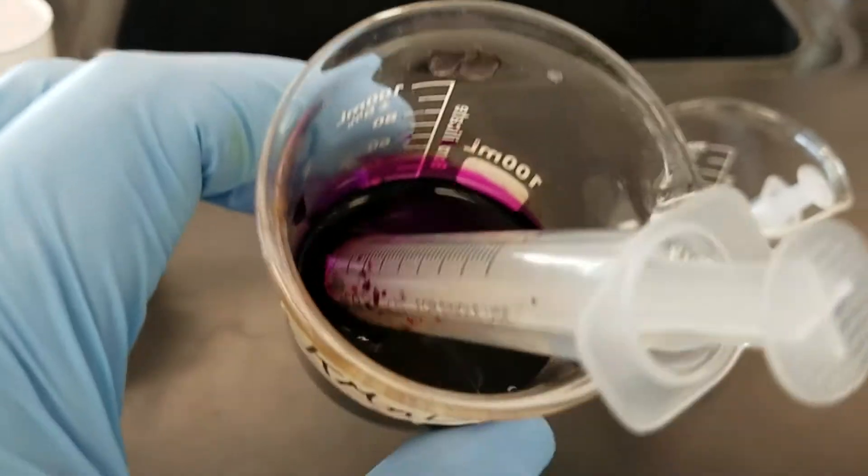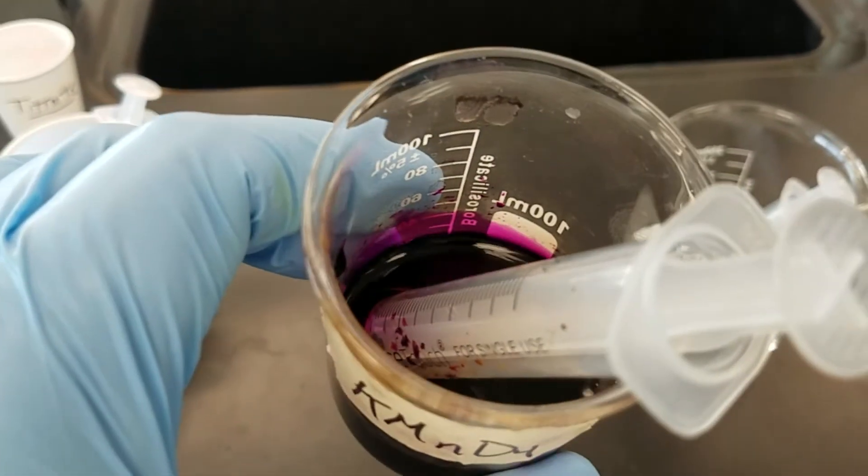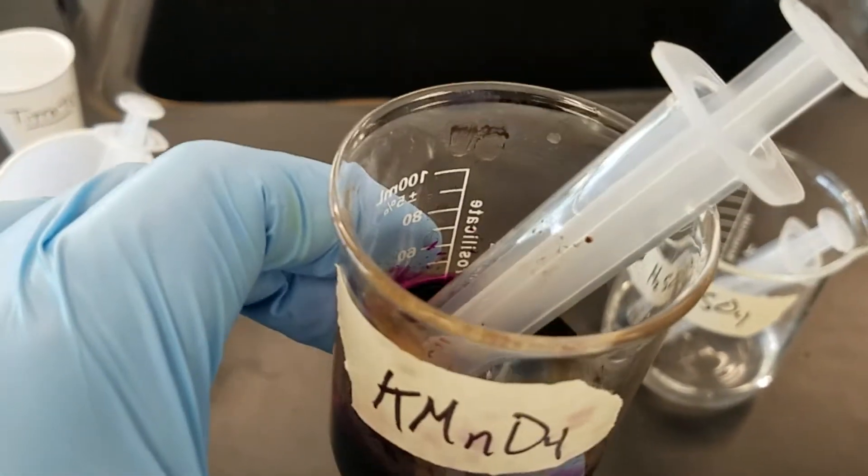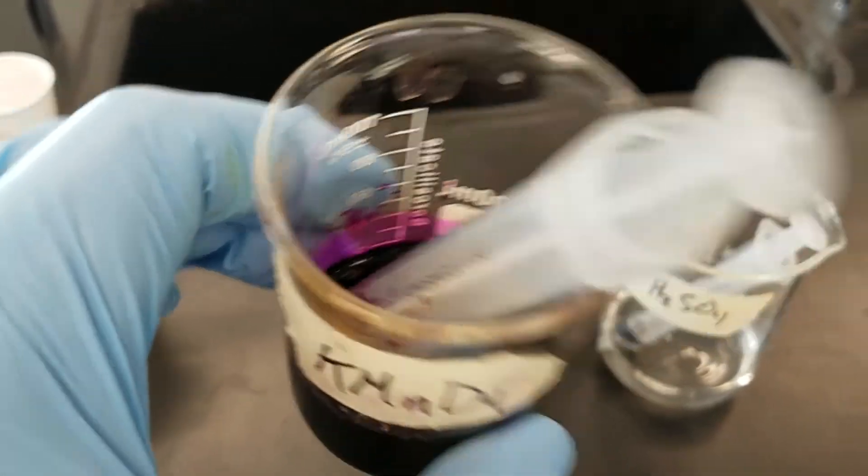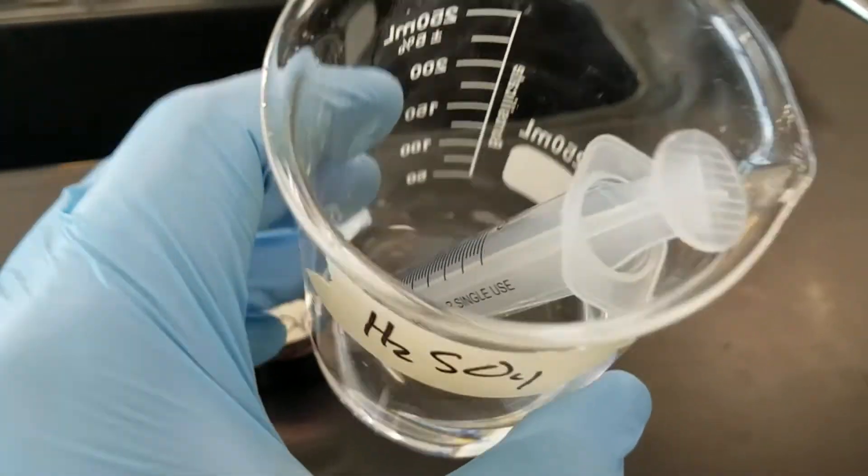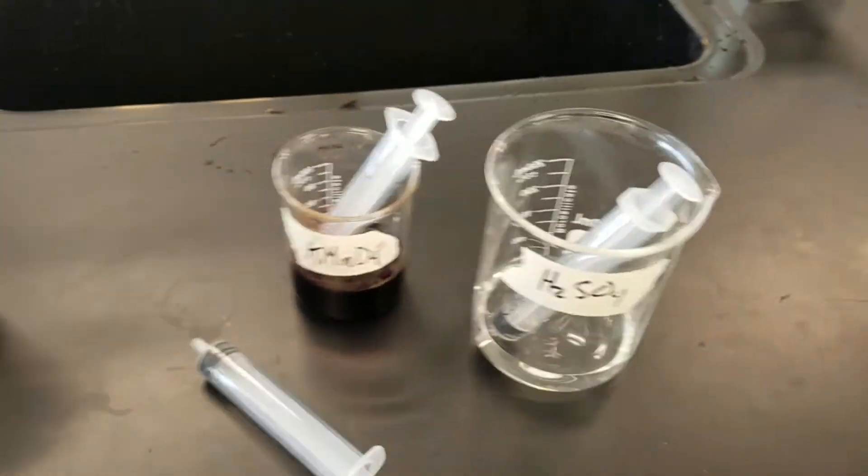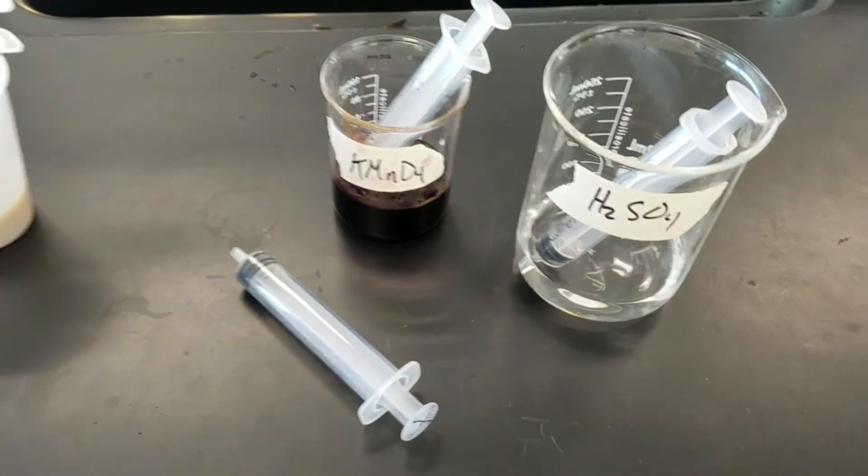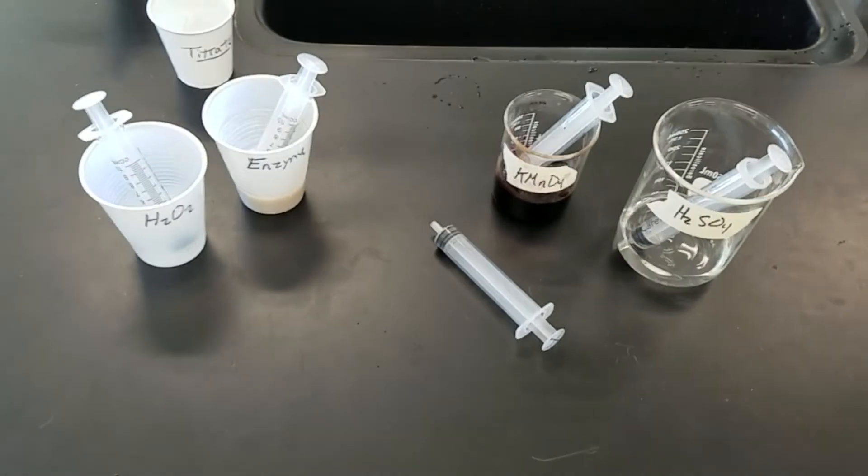Potassium permanganate is very purple and unless you want to look like Barney, I suggest rinsing your fingers off and not wiping your hands on your shirt. Acid will potentially eat through your clothes and as we said at the beginning of the year, if you touch your eye, you're going to have a bad time. Again, please follow all lab safety procedures.